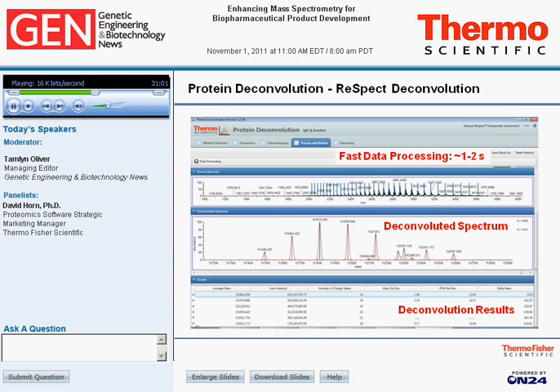And finally, on the far right side of the table, you'll see that there's a delta mass. So right now it takes the most abundant peak as the reference peak, and then calculates the mass of all the other peaks relative to that reference peak. So you can see that the second item in the table is 162 Daltons from the first, which is a hexose. The third row in the table is roughly 324 Daltons, which is 2 hexoses. Next slide, please.